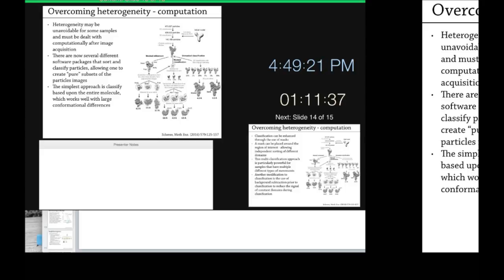And oftentimes you'll see that if you do auto-picking, say my cup is the particle, but auto-picking picked here because you have another one that's right next to it. If the size difference between particles is not quite right for that, it'll pick one or the other but not both. Then I'll go back to the initial particles, delete that and pick this one and pick the nearby one. So, you need to go by each image? If it seems to be a significant population that is not able to align well, then I will.